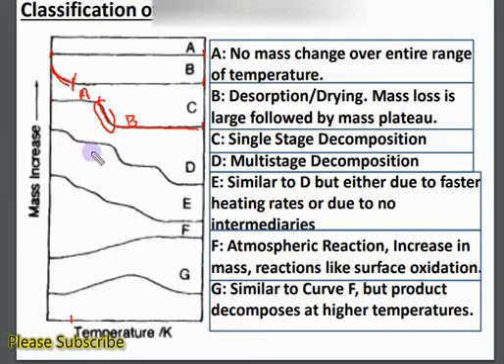Let's suppose initially we have a substance A; after the first decomposition we obtain a new material, which is B. After the second decomposition we obtain a material C, and in every step we are decreasing in mass, simultaneously with the synthesis of a completely new substance. After this step we obtain a new material, which is D, and it is stable up to this temperature.